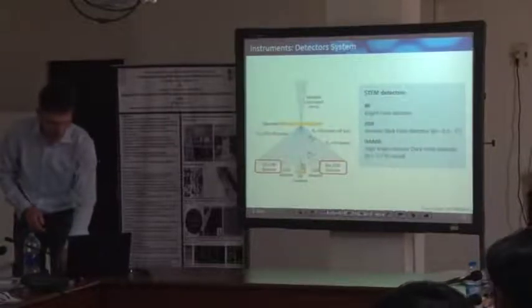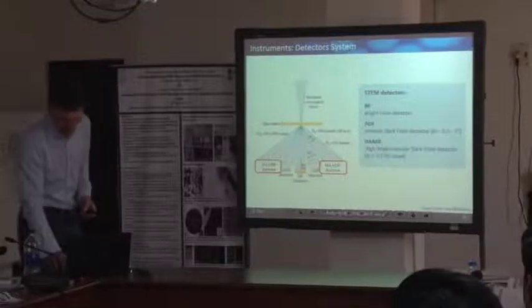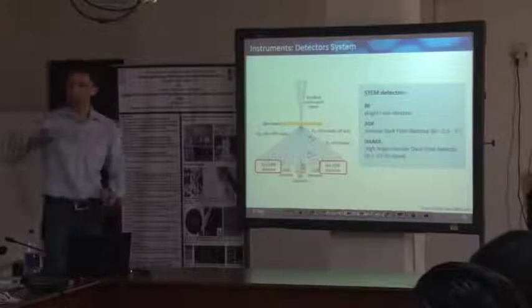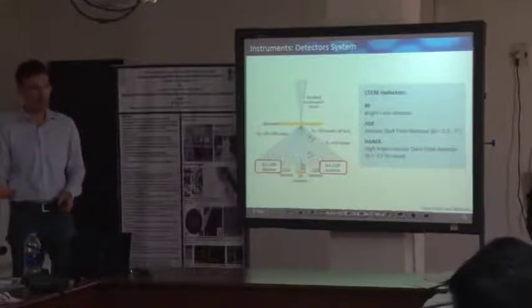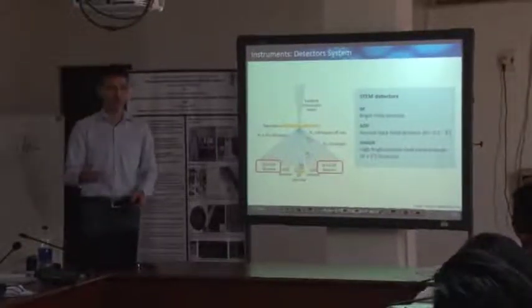So let's have a look how such images look like, just for different materials, so that you get some pixel after line of probe. You can activate this raster scanning. You can set the dwell time like in the scanning electron microscope, and just for search and focusing and all that stuff, you just use a short dwell time.